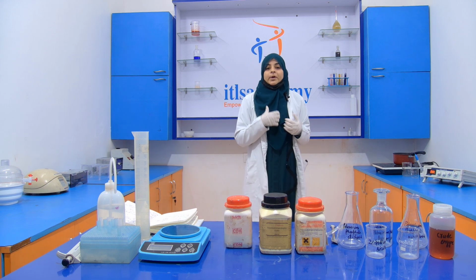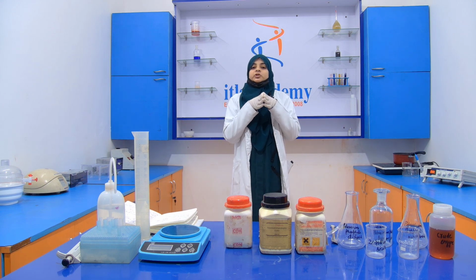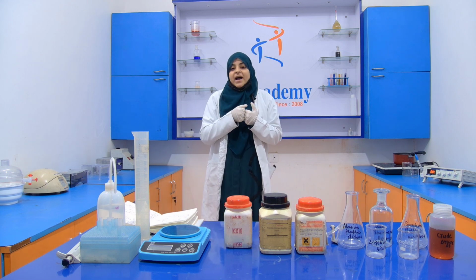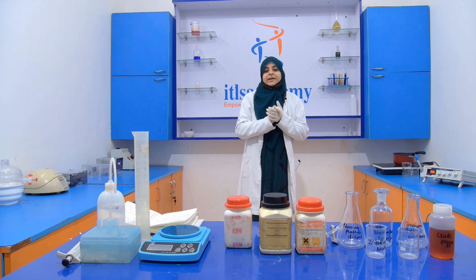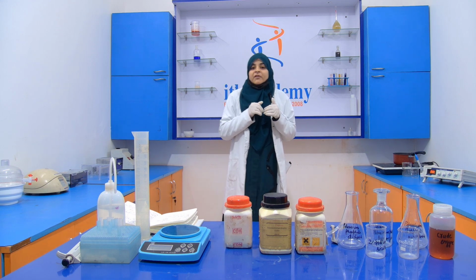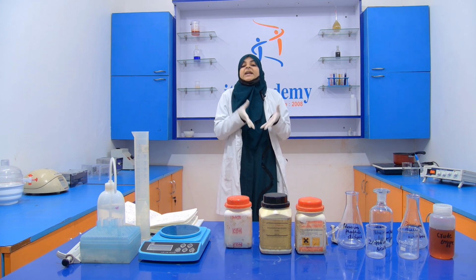Today we are going to perform an experiment, the purification of protein. Here we purify the protein by the method of dialysis membrane. Okay, so before starting the experiment, we have to know what this protein means.